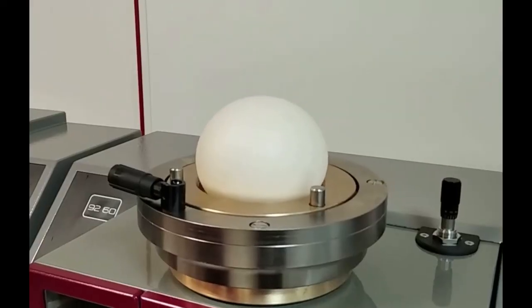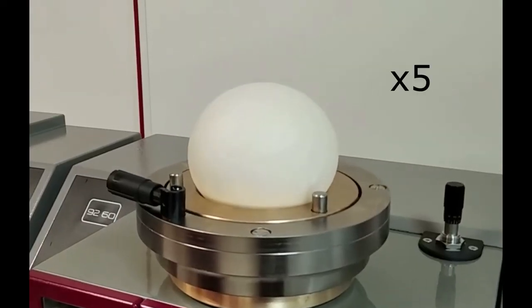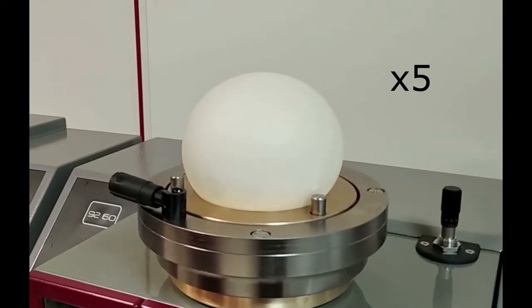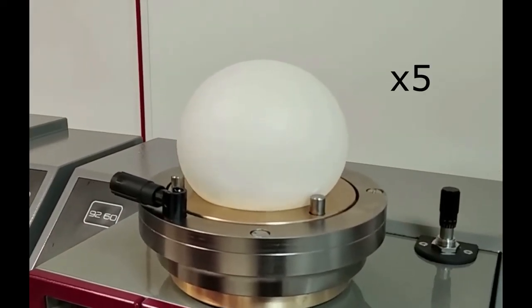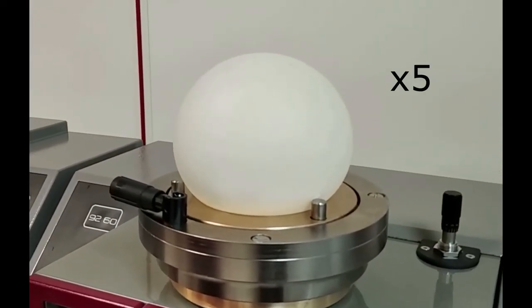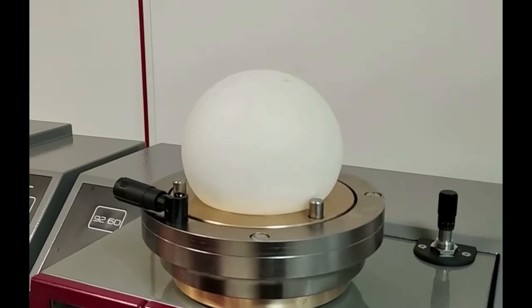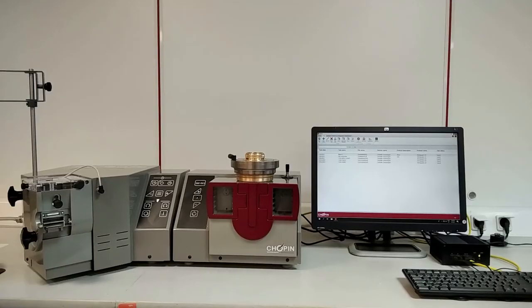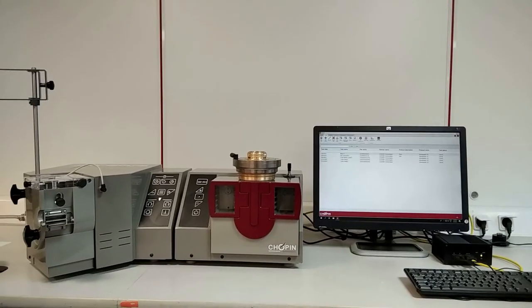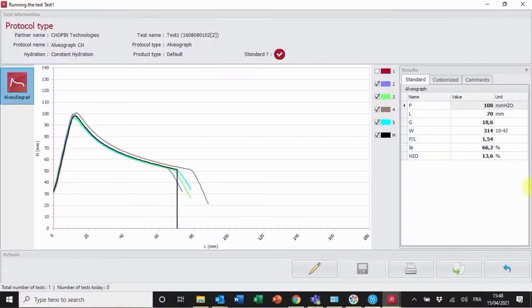Repeat this operation on the four remaining dough pieces. Proceed by order of extrusion. The results are measured from the average of the five curves obtained. This is called an alveogram.